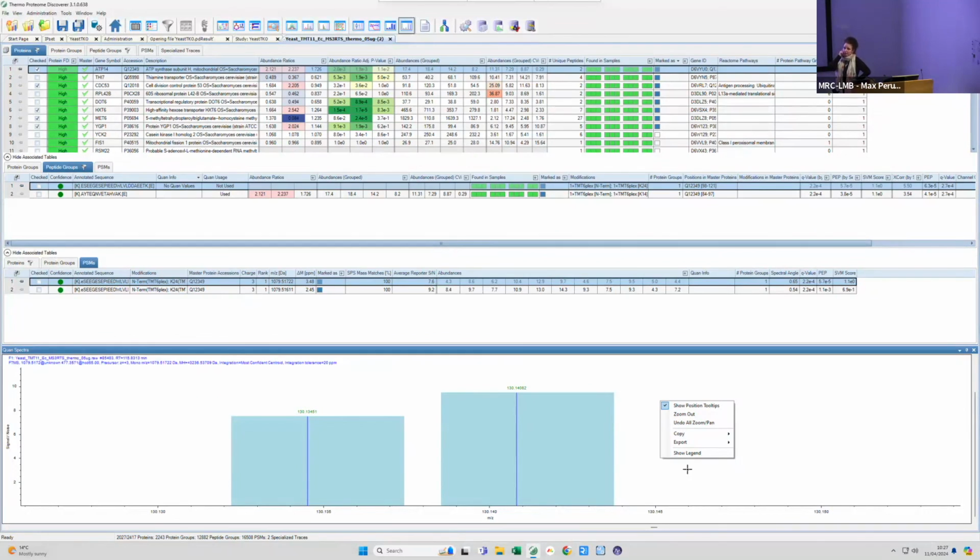And eventually, towards the summer, hopefully if everything goes okay, we'll also have a bioinformatician with us who will help you get more out of your data. Again, I don't want the bioinformatician to be doing this very basic stuff for you. I think there's a level of empowerment in you being able to look at your data and extract basic results. But if there's a complex analysis that needs to be done, the bioinformatician will help you do this.